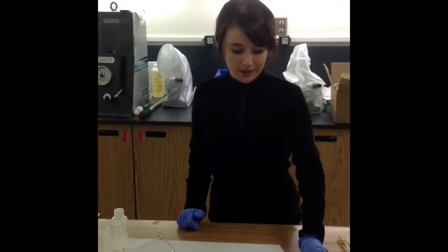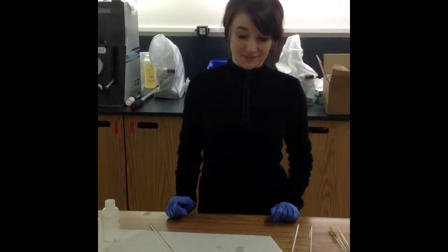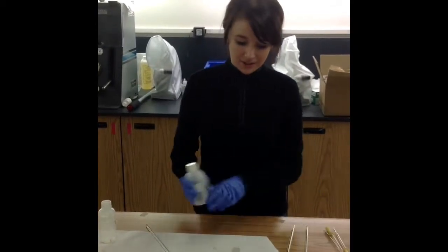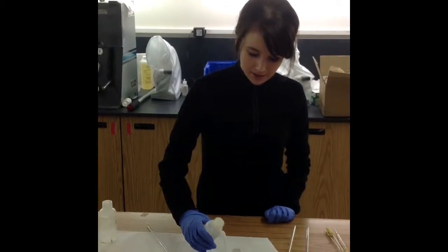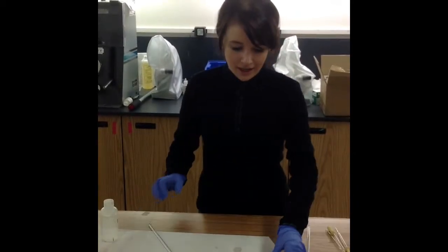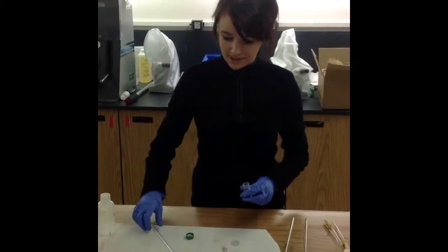First of all, I'm going to test my compound, my sample, for acidity, pH under 7. First of all, I'm going to take the litmus paper and I'm going to put a drop of water, and then I'm going to dip my glass stir rod into my sample.